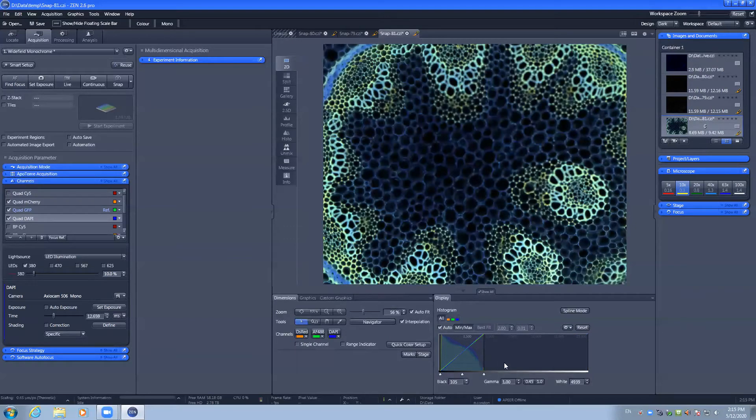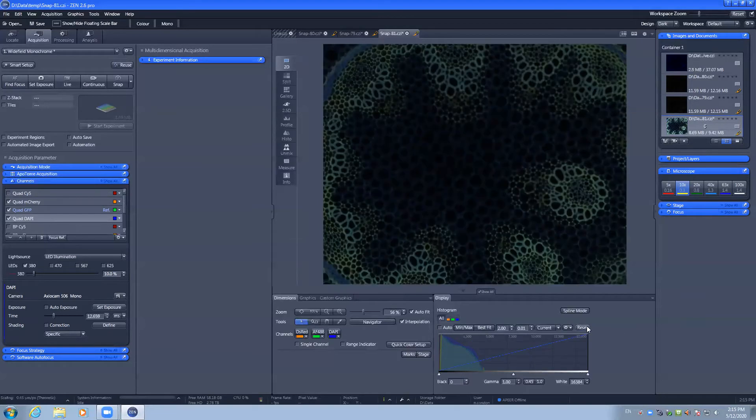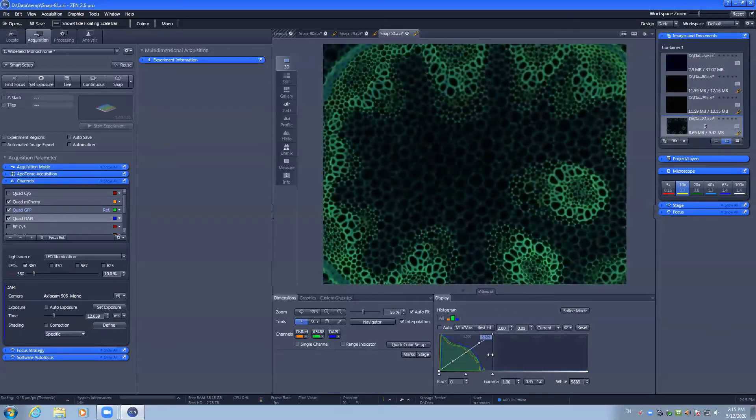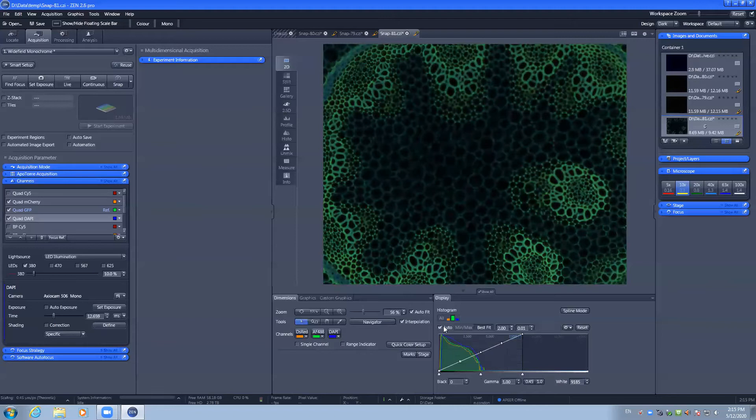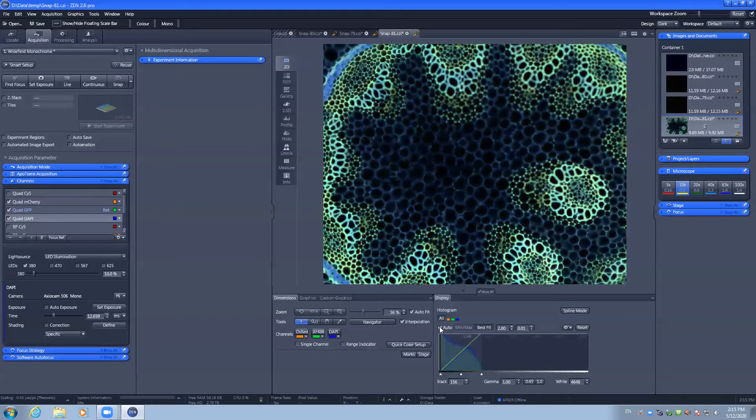Lookup tables suited for the screen either by min, max, a best fit. You can reset them. You can individually adjust channels by manually dragging or doing auto by selecting all and auto.